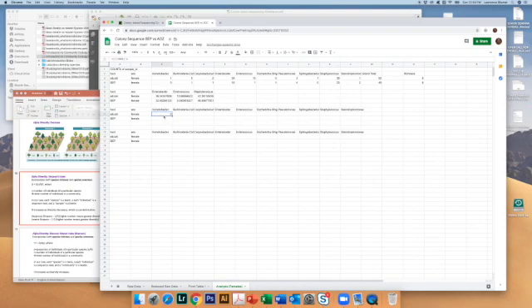So what just happened here? Oh, I typed in the wrong thing. It shouldn't be C1. It should be C3. Good. There we go. Okay. Now, I would click on this and drag across.